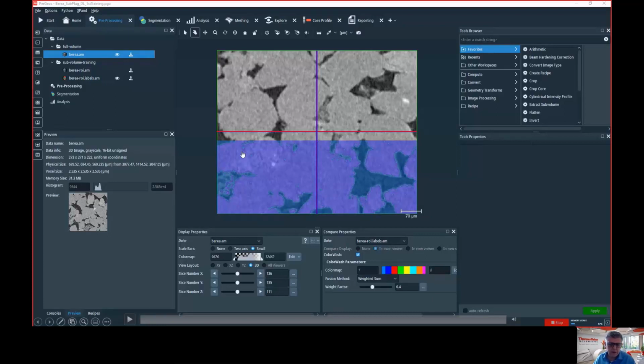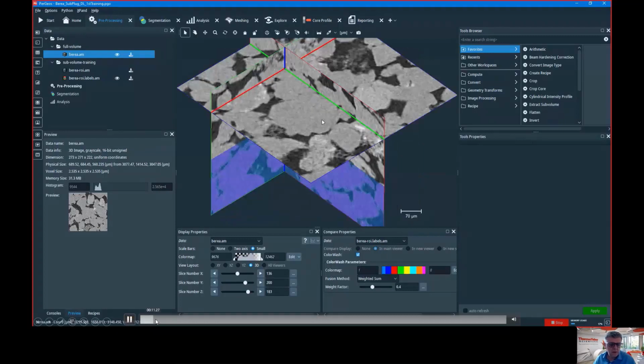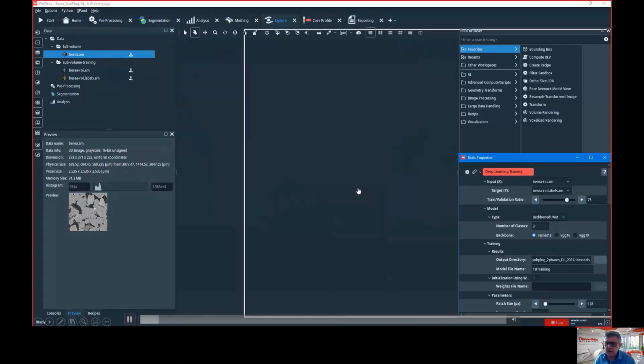That's the standard scenario. Here, to make it simple, I have my Berea, I have a region of interest that is this portion, and I have the labels only on this region of interest. And I will try to predict. So I jump a little bit. You see where I have the segmentation is just the bottom part.